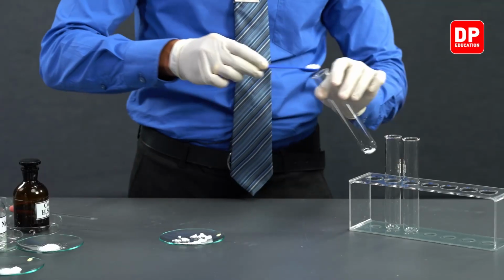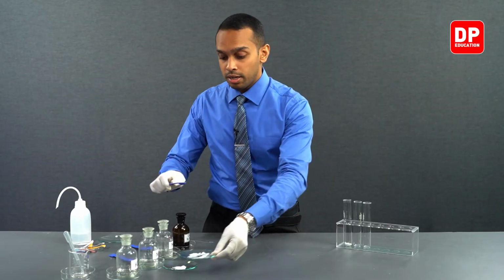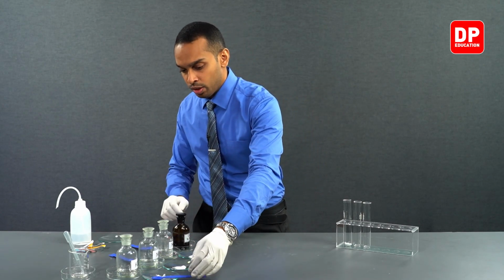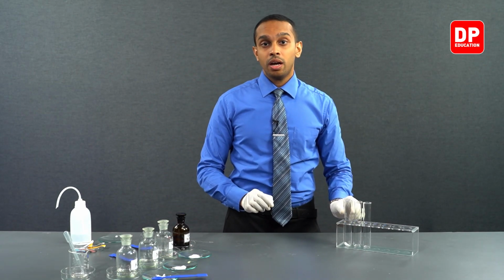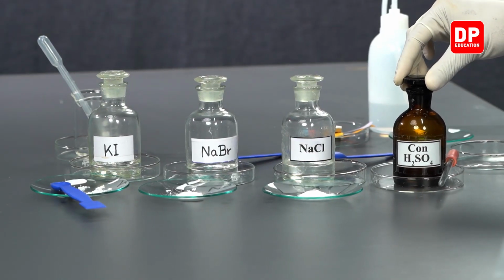After taking a small amount of potassium iodide solid into a boiling tube, let's add a little bit of concentrated sulfuric acid.